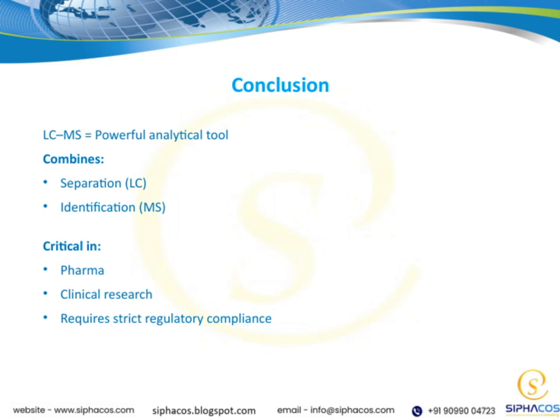But of course, working in these areas requires strict regulatory compliance to ensure safety and efficacy. Overall, LC-MS's strength lies in its ability to deliver detailed, reliable data, making it an essential part of modern analytical workflows.